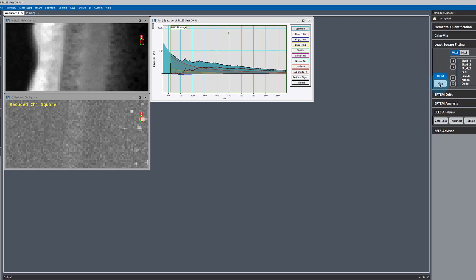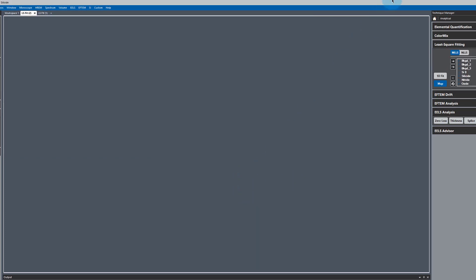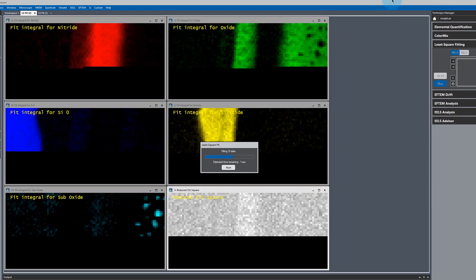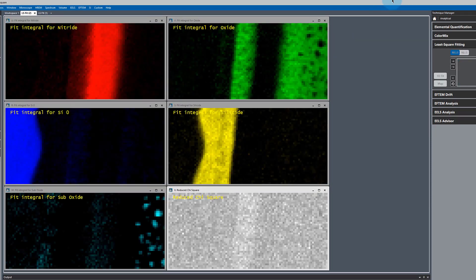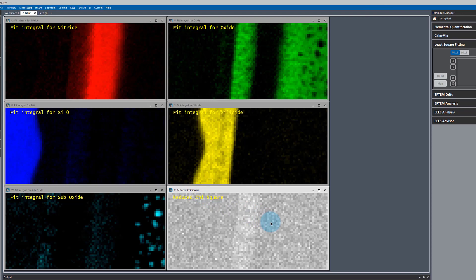Now let's see what happens. We hit our map. And we get very good fitting over all of our regions. And our reduced chi-squared is very uniform. That tells us we have a very good fit.